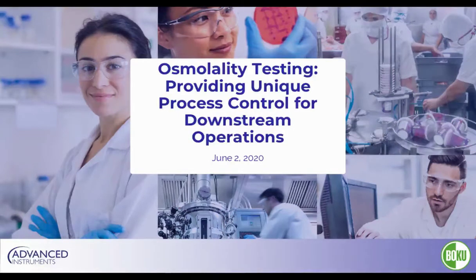Thank you so much for that introduction. My name is Kristeena Wright, and today I will be talking a little bit about osmolality testing, and we'll be joined, as was mentioned, by Dr. Alois Jungbauer of the BOKU to talk about how this test really provides unique process control for downstream operations.